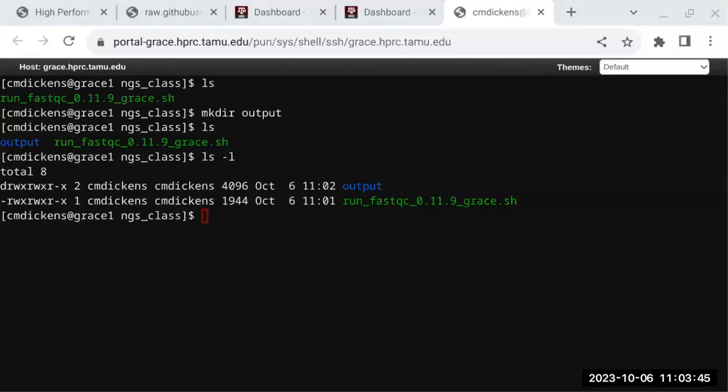So this is an example of what the template script looks like. We saw it on the web. SBATCH parameters at top. These are recommended parameters. Notice this CPUs per task up here is 2. You can use this variable called $SLURM_CPUS_PER_TASK, all underscores in uppercase like that, with a $ sign. So if you're going to scale your job and next time you want to use 48 cores instead of 2, maybe you're doing some testing with 1 file, then you want to use the entire node, you can use this value down here. So later you only need to change it here.